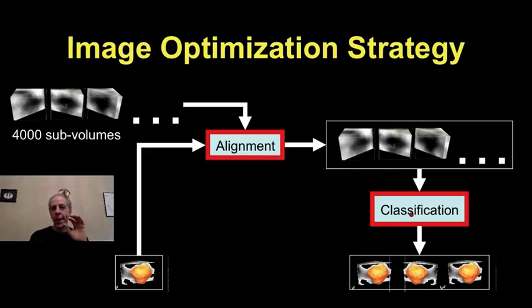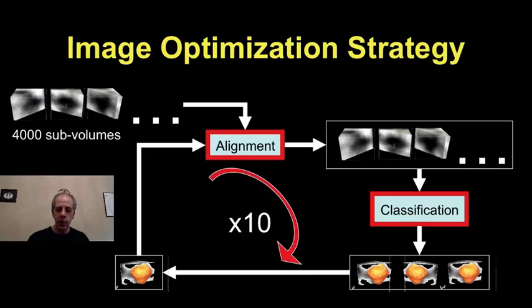Once you group, if you did everything right, you can basically average them. And we know that the average will reduce the noise. That's what we talked about before. We explained it when we were doing image denoising. So you can kind of denoise them a tiny bit. And after you denoise them a tiny bit, you can say, hey, let's try to align them again. Now they're a bit more clean images. So we're going to align them again. We're going to cluster them again. We're going to align them again. And we're going to cluster them again.